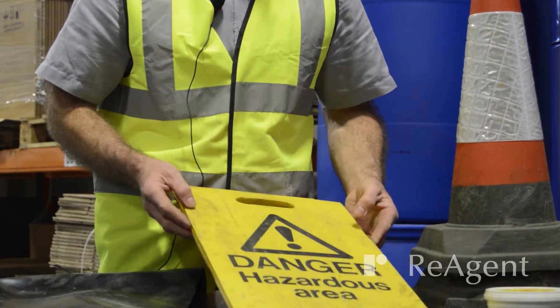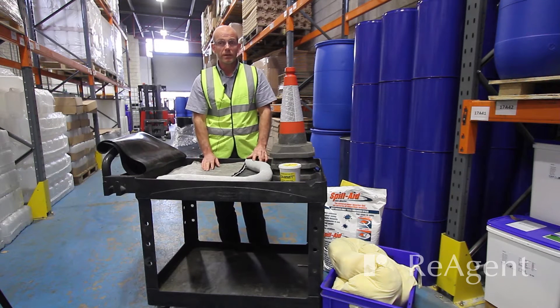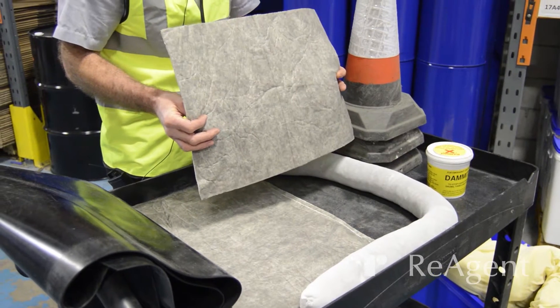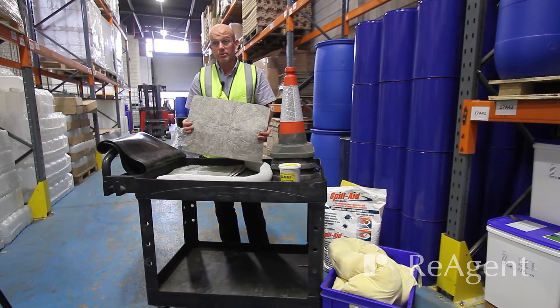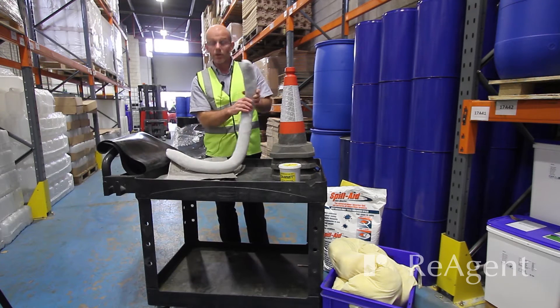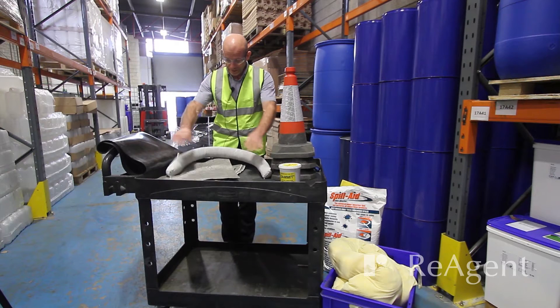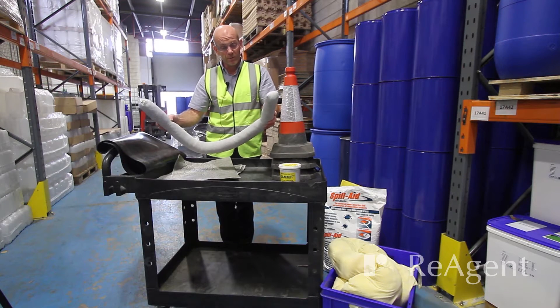The next component is absorbent materials. These simple absorbent mats are placed down on a small spillage on a tabletop or something very small on the floor. We also have these sausage-type things, called booms. You simply wrap a boom around the spillage to contain it — suitable for a very small spill or for placing in front of a drain.